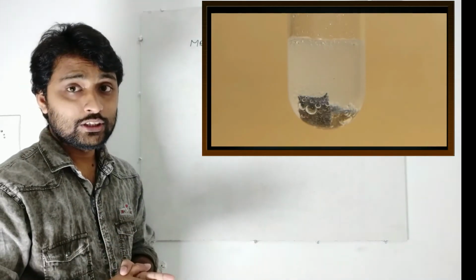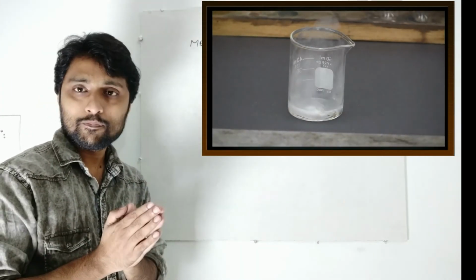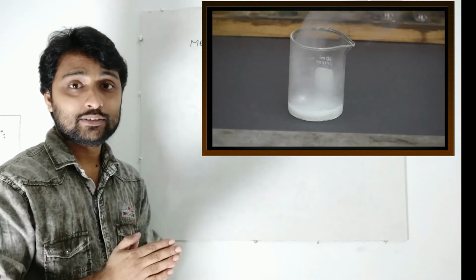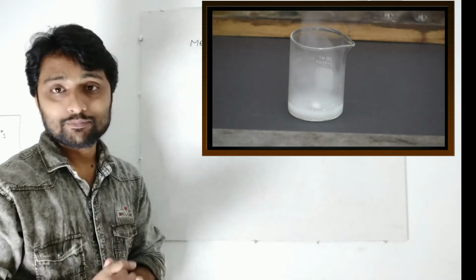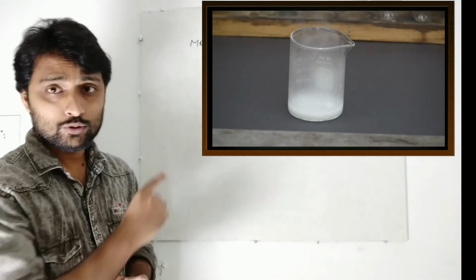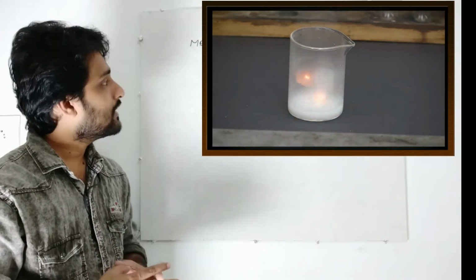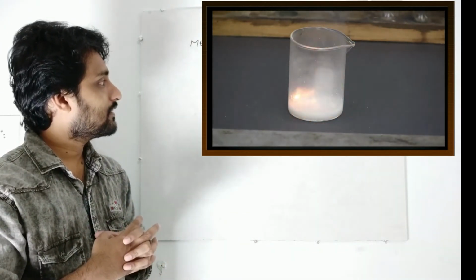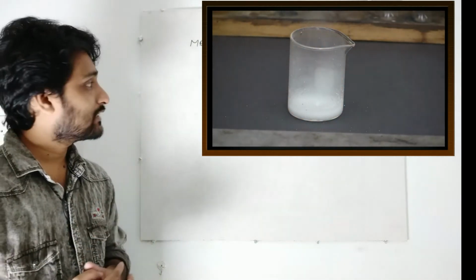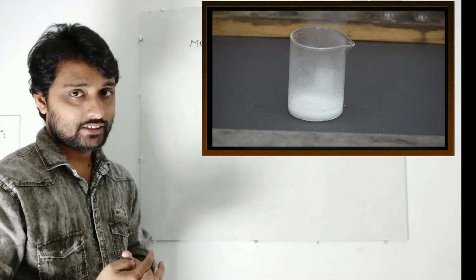Then do you want to see how sodium is reacting with the hydrochloric acid? It is showing a vigorous reaction, a very fast reaction, because its reactivity is very high, isn't it? Sodium, potassium. Okay. So it is showing a very fast reaction. So watch it. Yes, sodium. Yes, see that it's showing a very vigorous reaction, catching fire. So that is the reaction between sodium and hydrochloric acid.